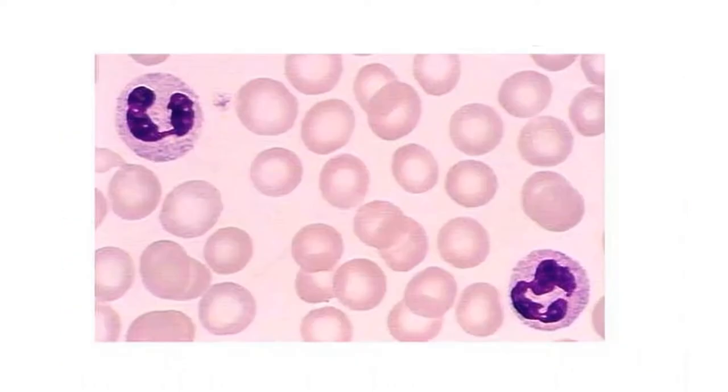All right, think for a minute here. This is connective tissue. Specifically, it's blood. This pink donut is a red blood cell. This darker dude here with the dark staining nucleus is a white blood cell. And the white stuff in the back is the fluid matrix or the plasma. Function, transportation. Location, cardiovascular system.